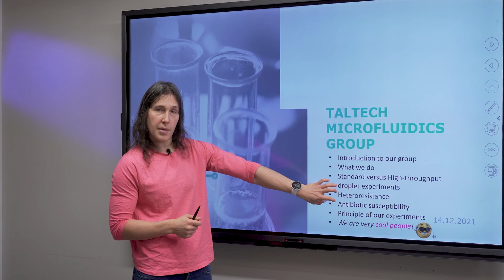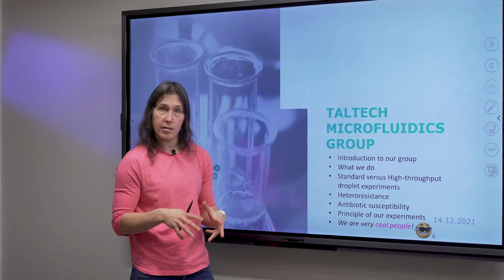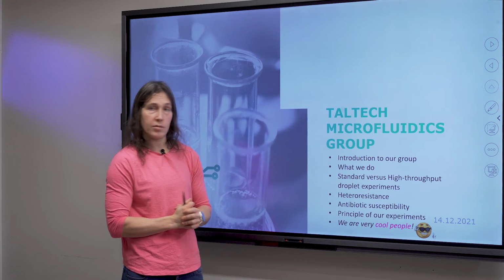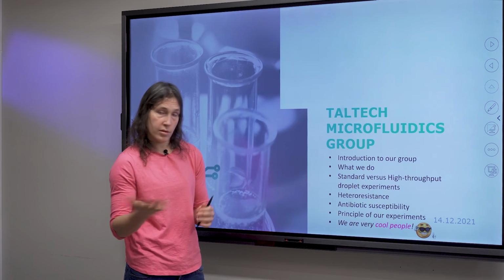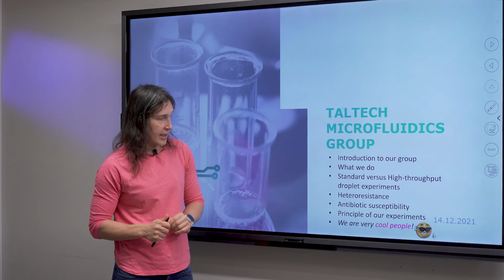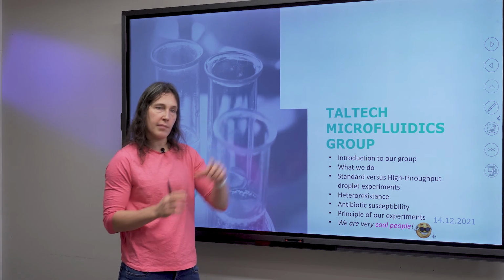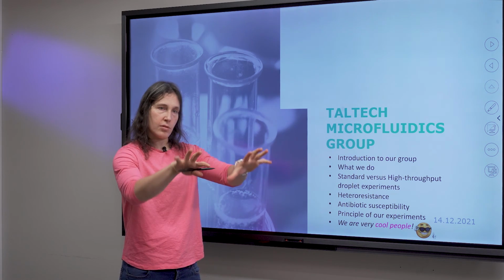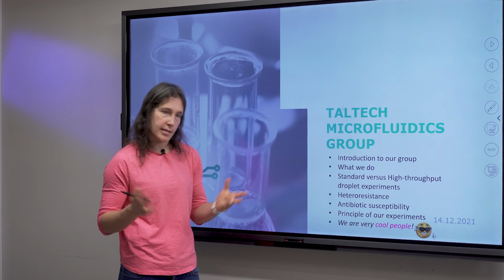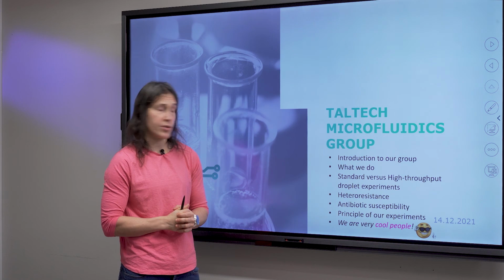I explained a little bit about heteroresistance, that some bacteria, although genetically the same, can respond differently to antibiotics, so they can still grow or not grow. And finally, I talked about the principle of our experiments, that we incubate them and they fluoresce or they don't. And we then analyze the droplets. The analysis part will be a part of a different lecture.